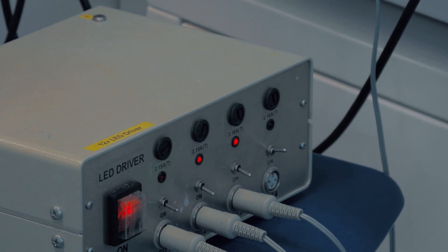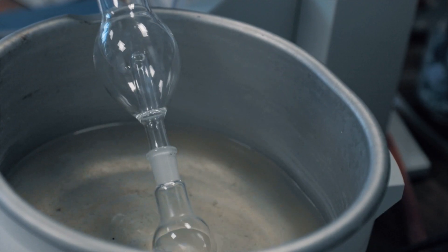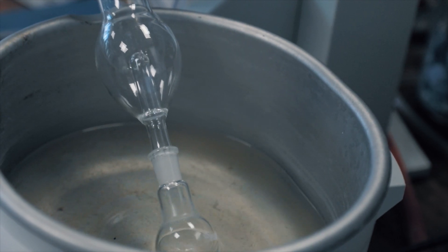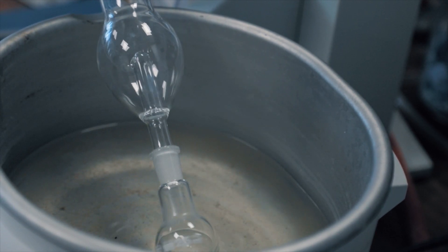They say they found one in the process for separation and purification. They've all experienced manually packing, filling, and processing columns. Now that process is done automatically.